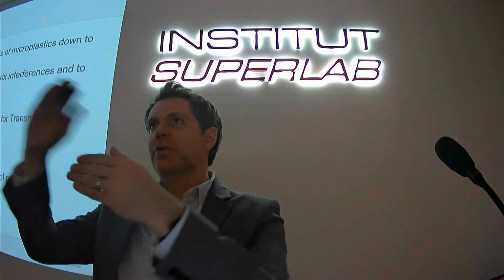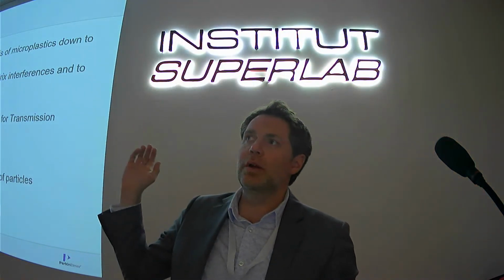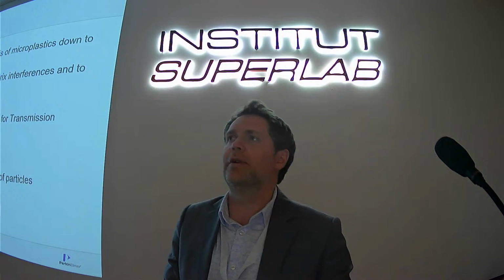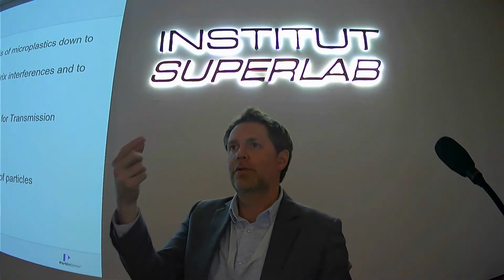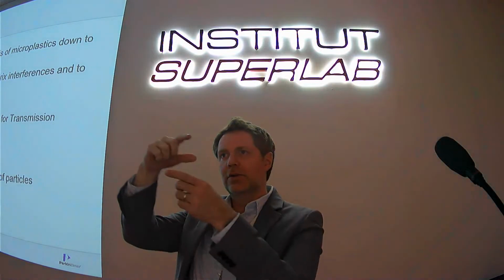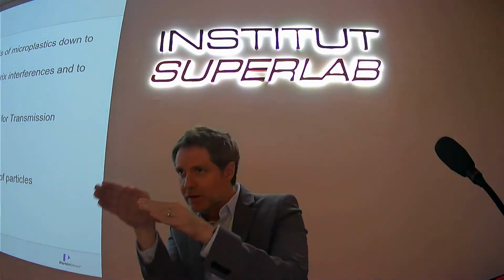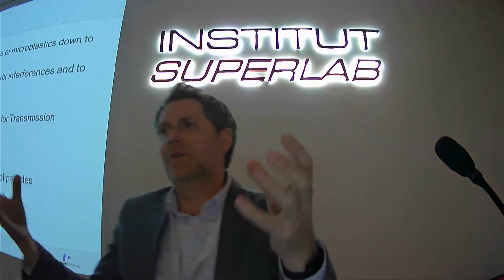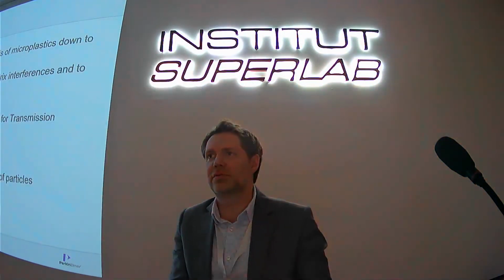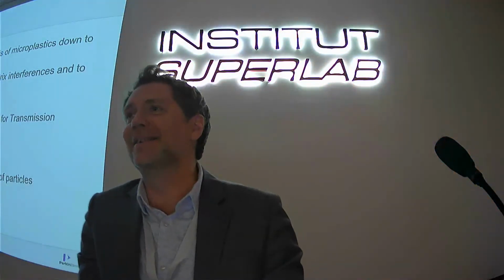So you're obviously only seeing the edges. But what's quite nice is that we did a lot of analysis on, say, a UK penny. If you look at the penny coin, it's got a little gate on it with the feathers. We can look down and see the slope of the side. But yes, reflectance, because if it's a thick sample, you can't get transmission through the sample. But I'm glad you noticed that. It's a good point.